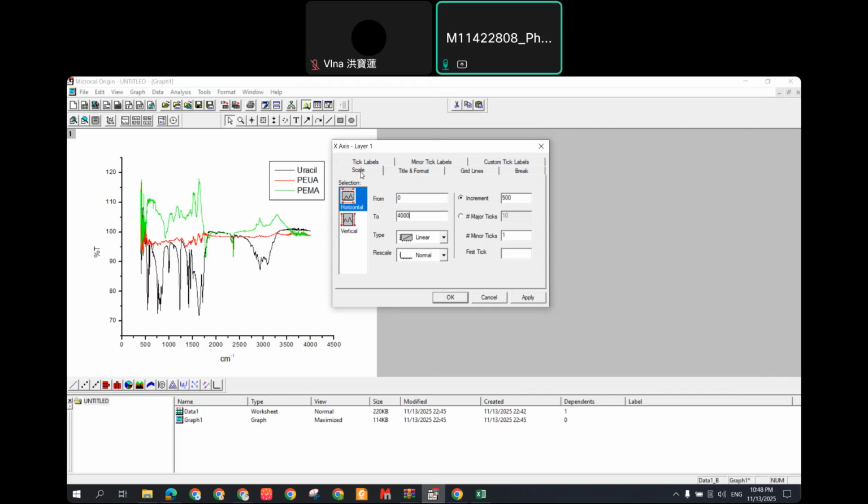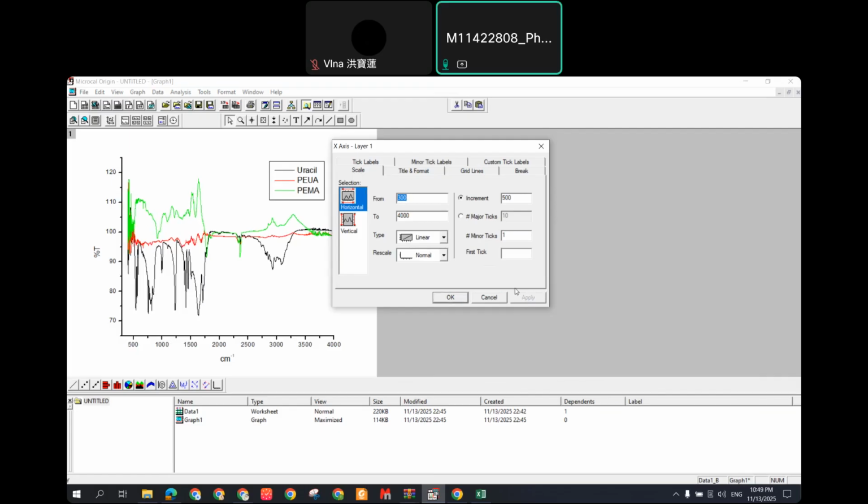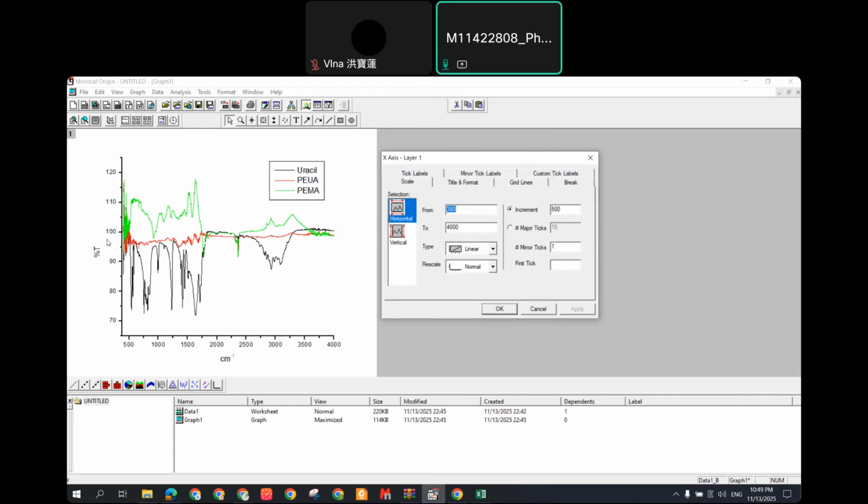We can change the scale from 4,000 to 400, and then apply. Okay, maybe not 400, maybe 300. Okay, apply. Maybe 380. Apply.